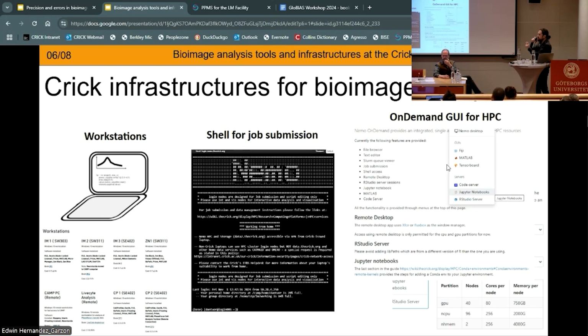Now, all this is great, but actually, if we need to provide some tool, for example Fiji, it means that the HPC will produce a specific flavor of Fiji, and we have limited flexibility in installing plugins. So our difficulty is also to communicate with HPC people and explain that we want freedom.